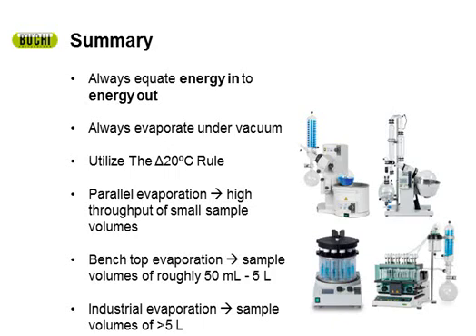Okay, very good. It looks like everybody's voting A, which is correct. The same parameters apply, so when you scale up, no problem. You don't have to redo your method development. The same exact variables will apply. Next question.